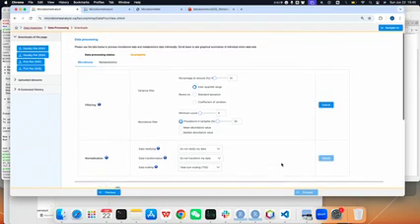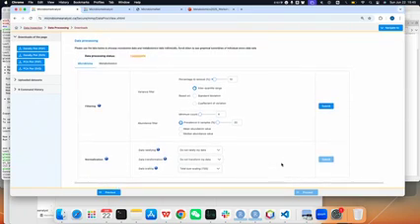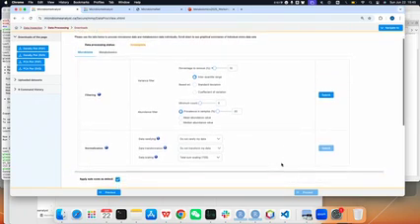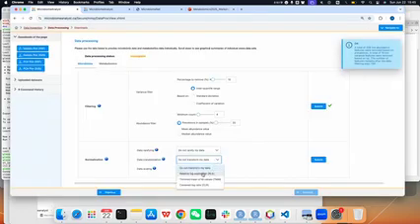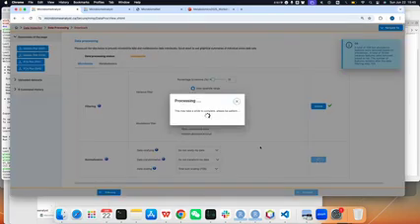This step is for the filtration and normalization, which is always the same as for single omics data. For the microbiome data, it's the same as the marker gene part, so I'll just process it quickly.